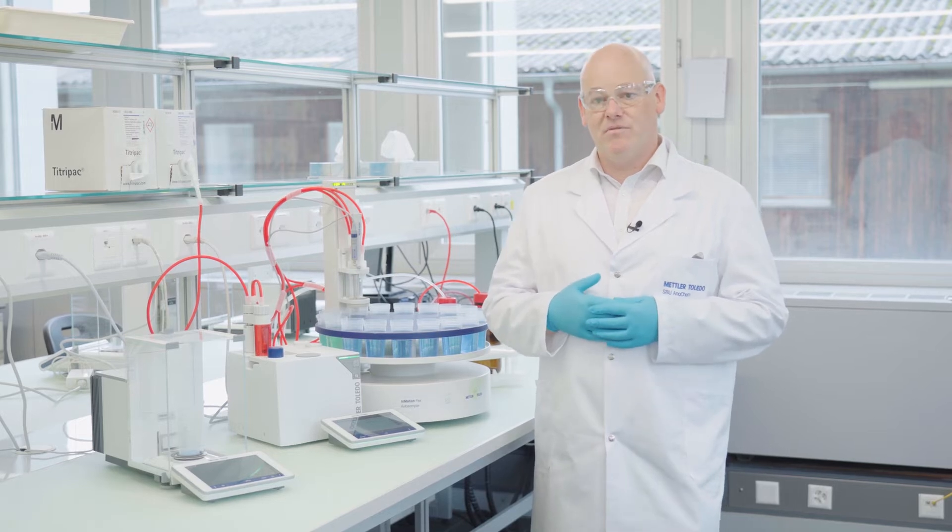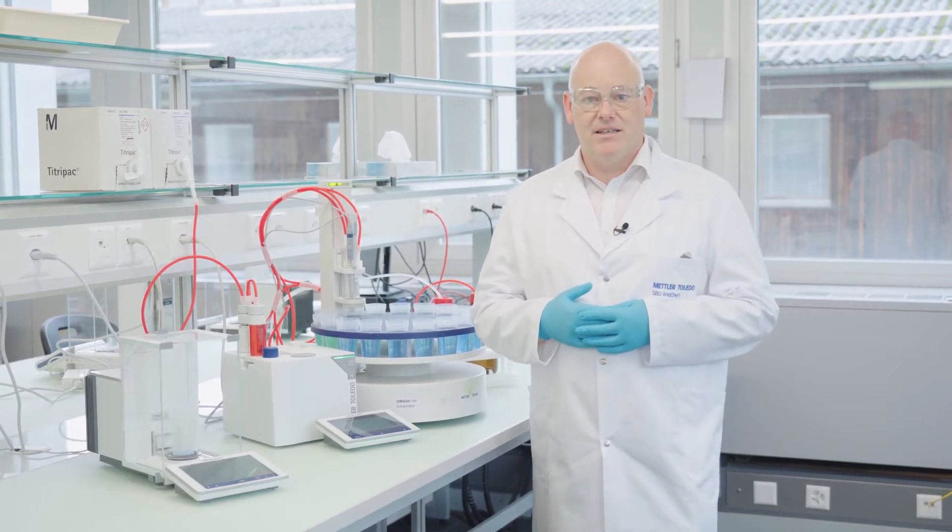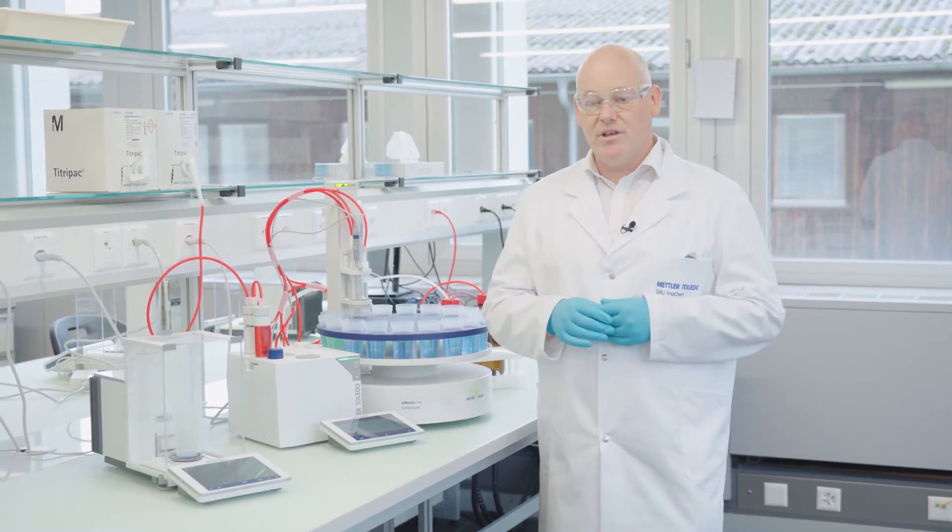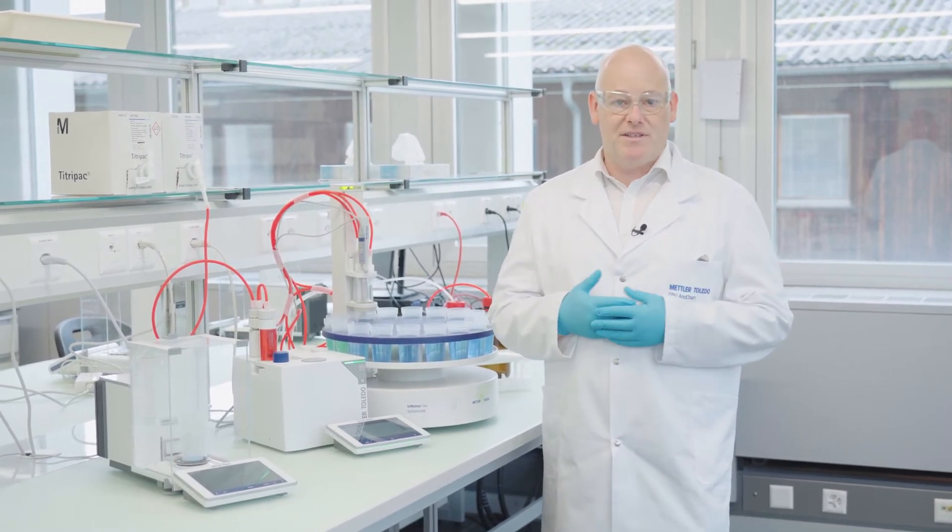Sample preparation in the laboratory is one of the most time-consuming tasks, but by making a few small improvements to your titration workflows, you can really boost the productivity in your laboratory.